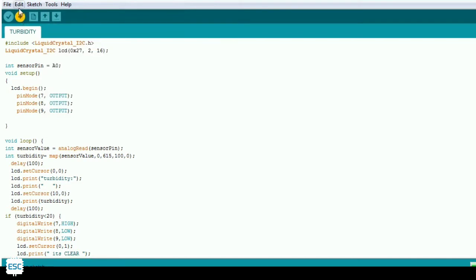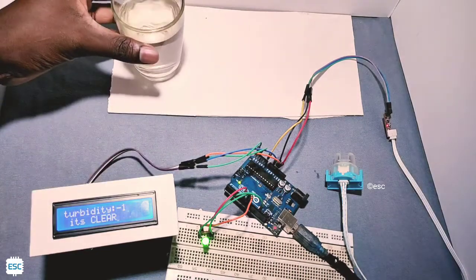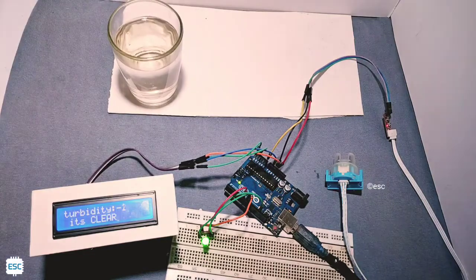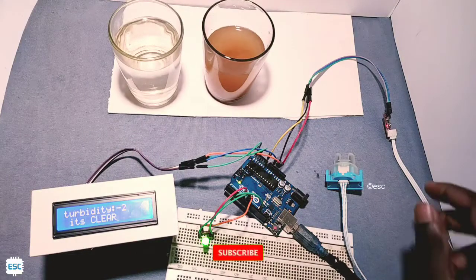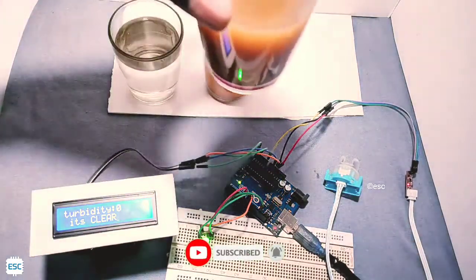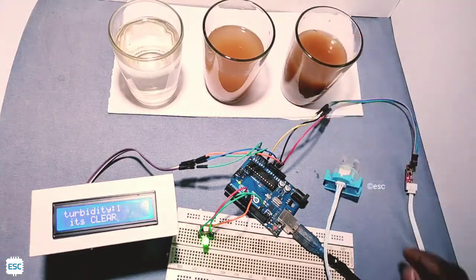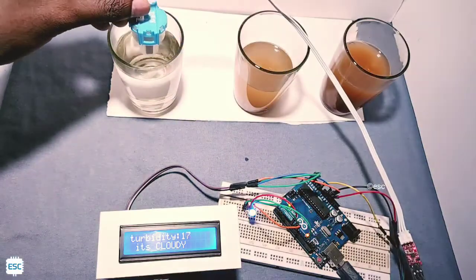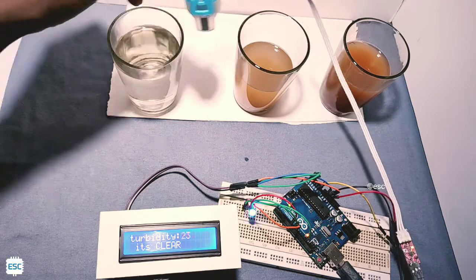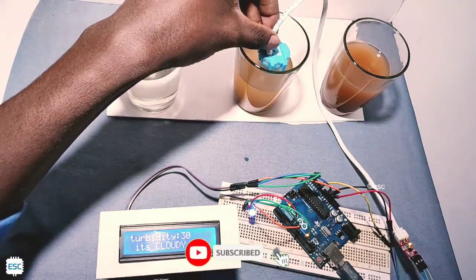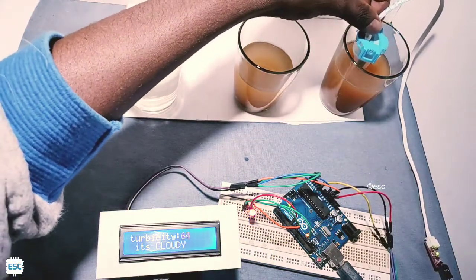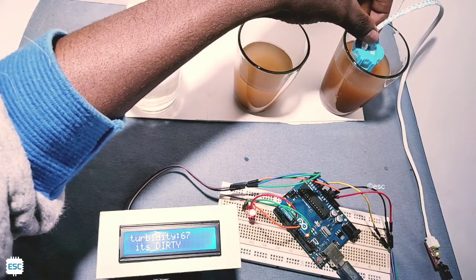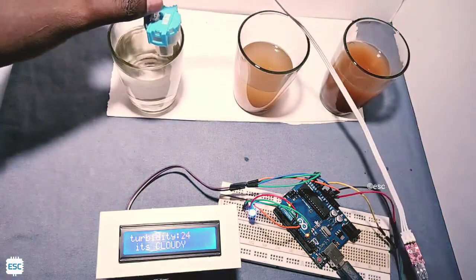After uploading code to Arduino, now let's check for demonstration. First I took a glass of clear water, then a glass of sedimented muddy water, and a glass of hard mud water. Now let's check. First I placed the turbidity sensor on clear water and you can see the LCD shows it's clear and also the green LED lights up. And in the second it shows it's cloudy and also the blue LED. And finally in the muddy water you can see LCD shows it's dirty and the red LED. So everything is working well.